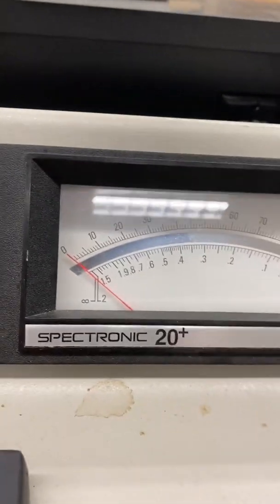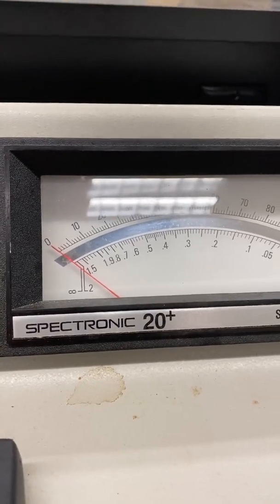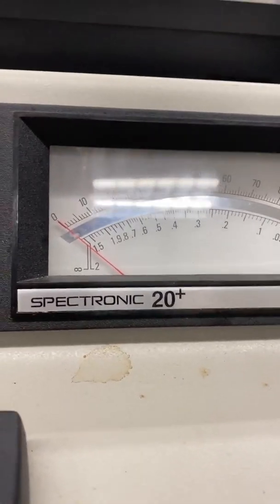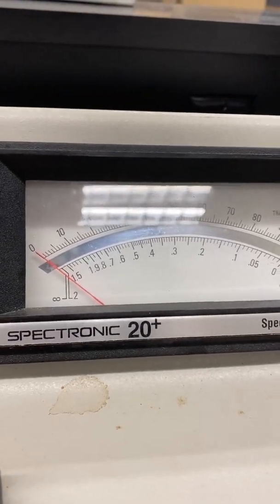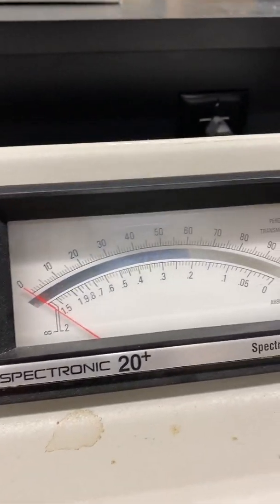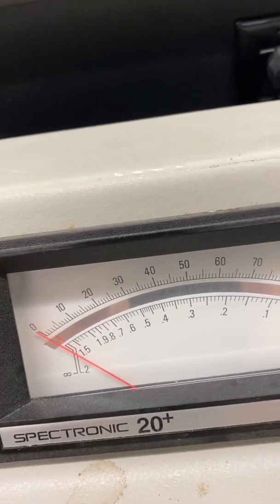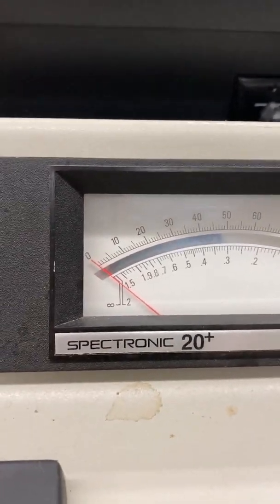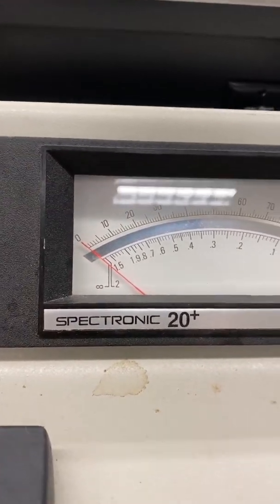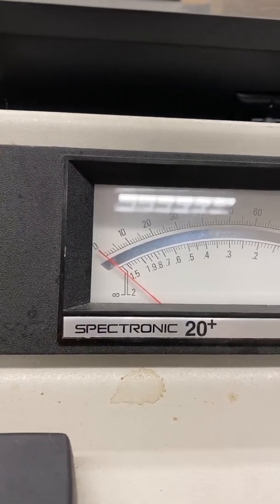When reading the scale, make sure that your eye is directly looking at the orange needle. This is the purpose of the mirror behind the scale. If you are looking at it from an angle, the reflection in the mirror will not be lined up with the needle, causing parallax error in the measurement. Line your eye up so that the needle and its reflection are right on top of each other.